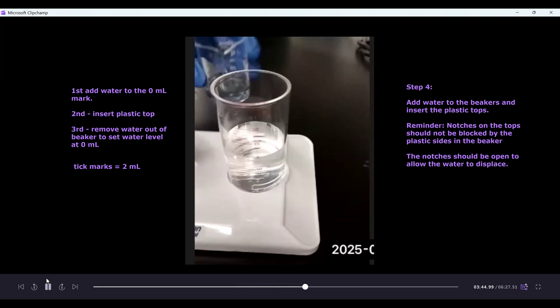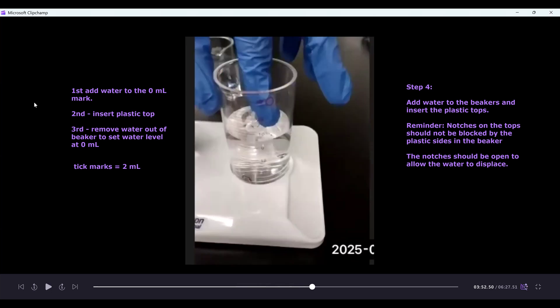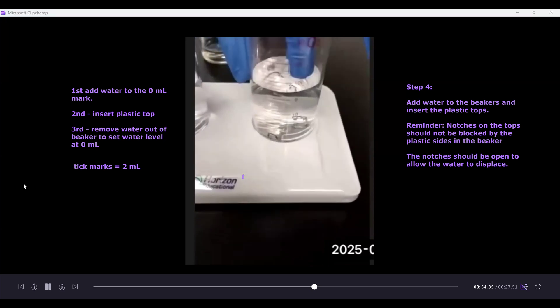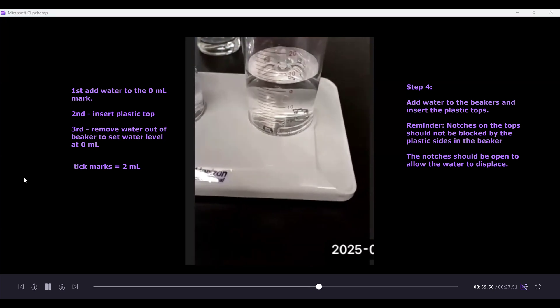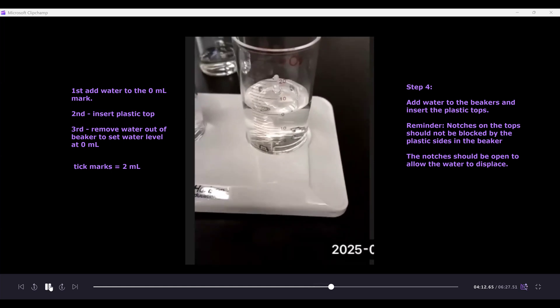We do the same for the oxygen beaker — first fill it to the zero milliliter mark. Again, keep in mind each tick mark is two milliliters. Once filled to the zero mark, add the plastic top, making sure the notches are aligned so the plastic sides do not block the opening of the notch. Here's the notch, and here's the plastic side — you can see the opening of the notch is not blocked, which allows the water to displace out. Then remove a little water with the syringe to bring it back to the zero milliliter mark. Now we're ready to add the tubing.